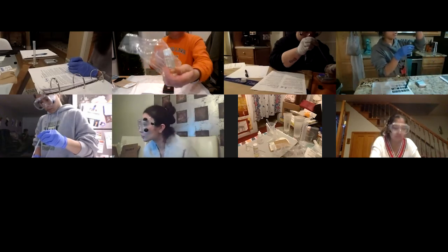There we go. 2.02 grams, close enough. Put the cap on a little tighter. Now you're going to need this again later.